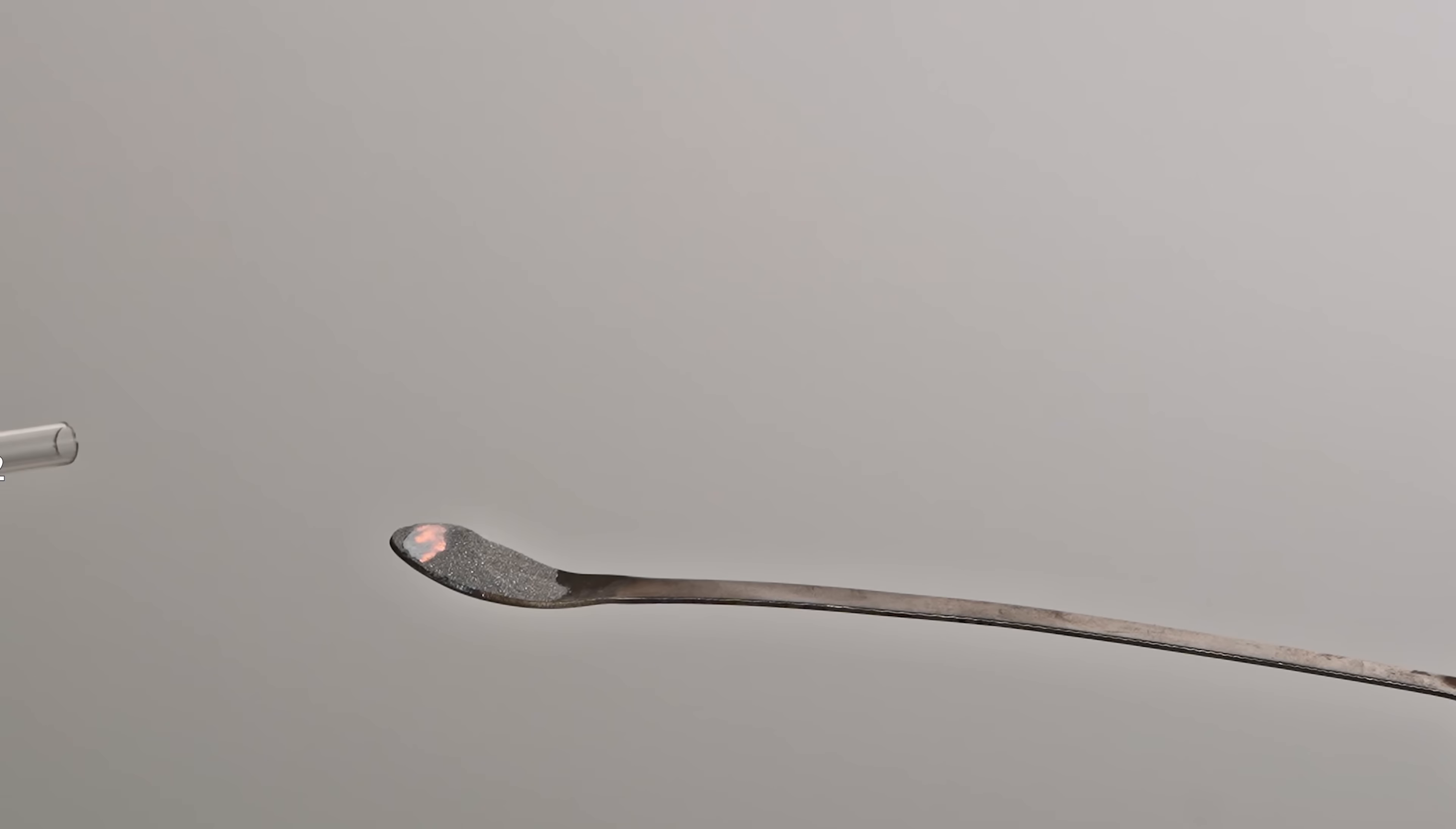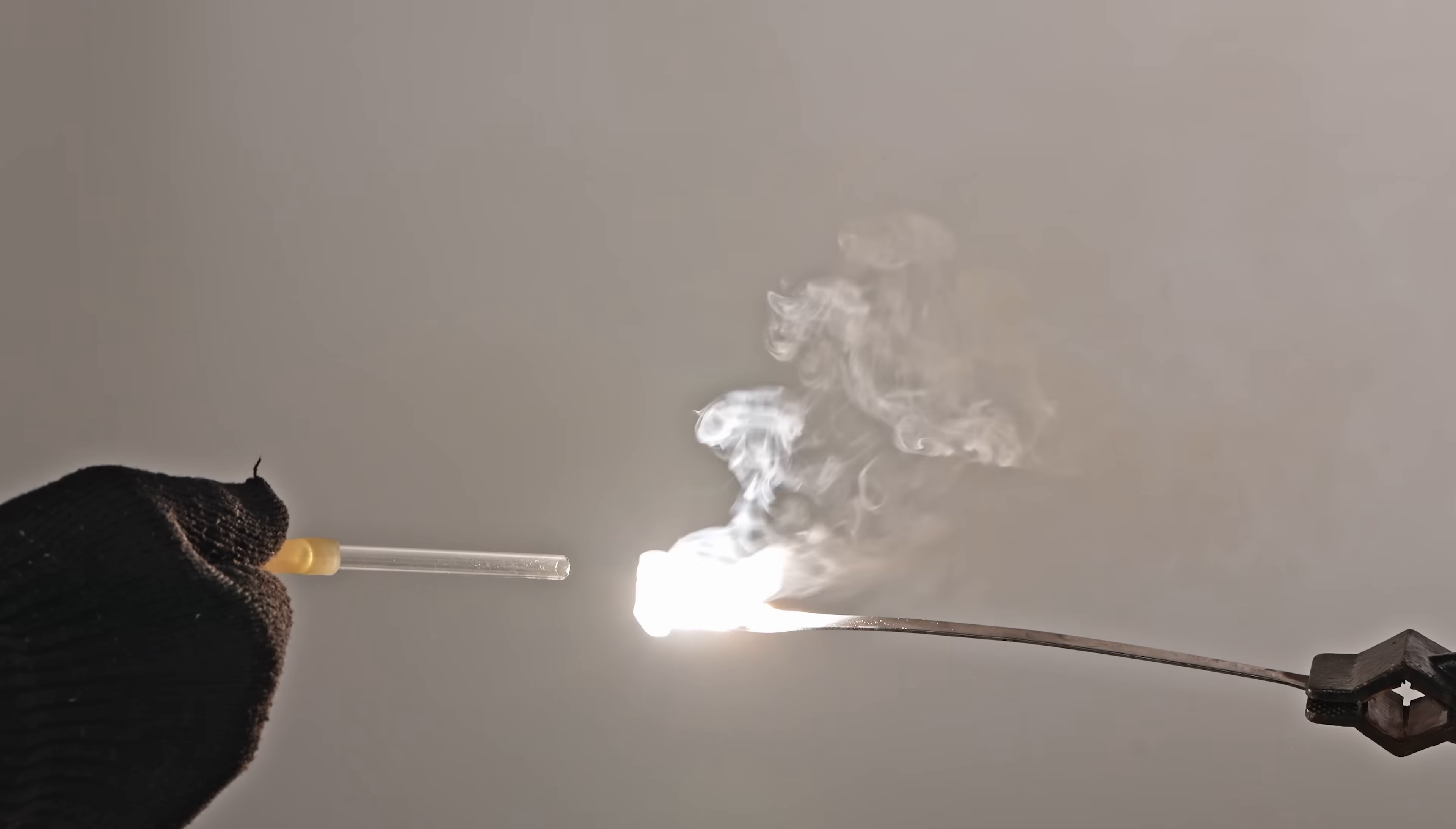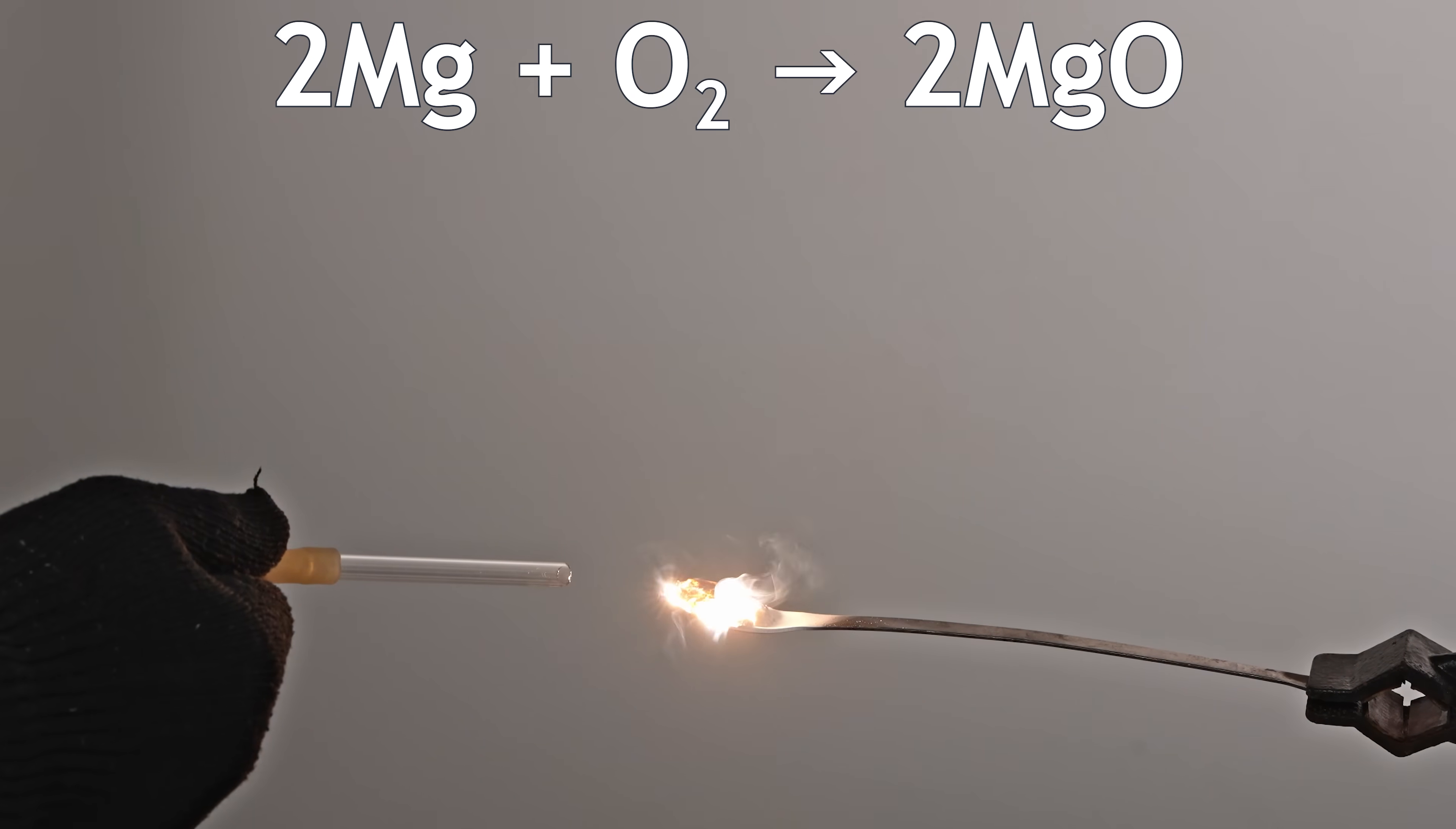Just as elemental magnesium burns in oxygen, magnesium nitride also burns in oxygen, producing magnesium oxide and nitrogen.